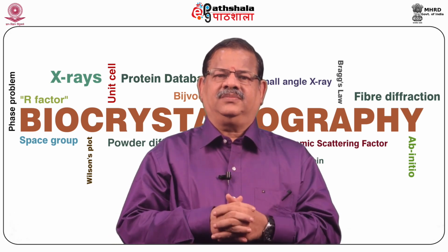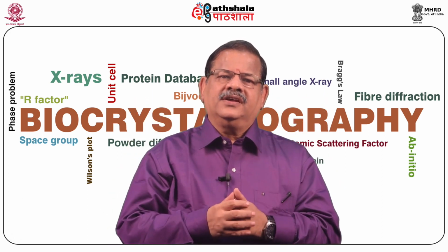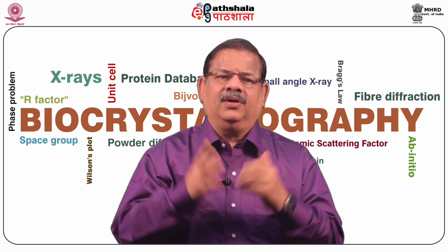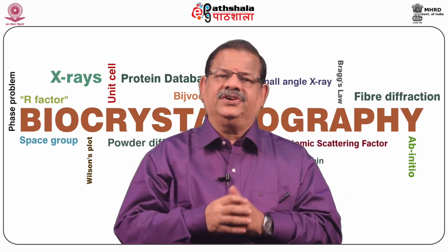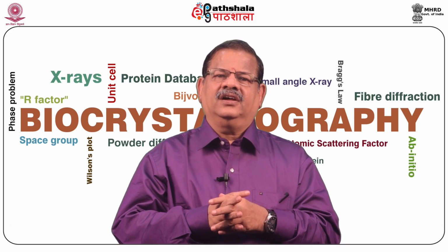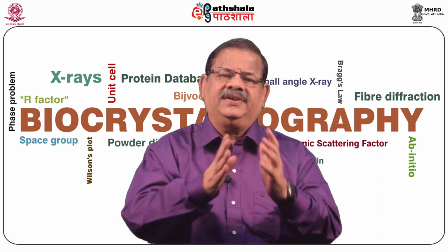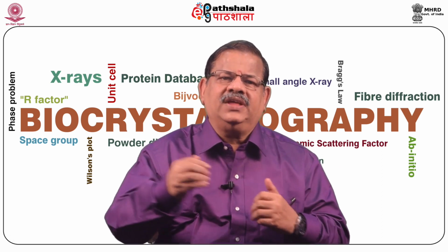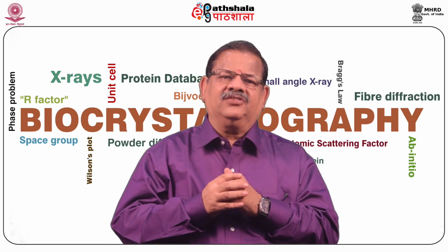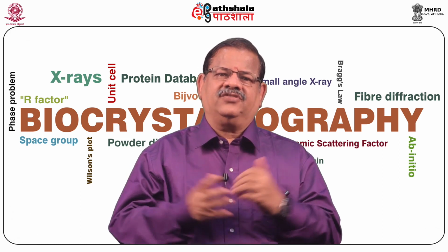During macromolecular structure determination, one may have to use many software packages and repeatedly use interactive three-dimensional graphics. A comprehensive system for the above problem, with automation of all procedures, has been developed as the PHENIX suite. The scripting layer is the heart of the system. With only a few exceptions, all major functionality is implemented as modules that are exclusively accessed via the scripting interfaces. The object-oriented Python scripting language, reference here, is used for this purpose. C++ is used as the language.